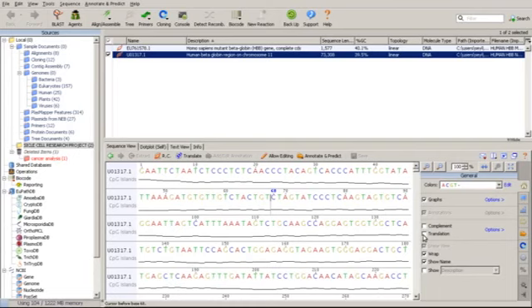So that's the gene expression in a way. We're going to be talking about gene expression, but then we'll be looking at how these amino acids actually code for specific functions and structure. That is later on in this bioinformatics course. But right now, let's look into how this Geneious application can actually deduce each codon and protein in this DNA analysis that we're working on.